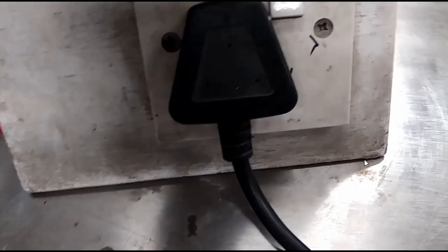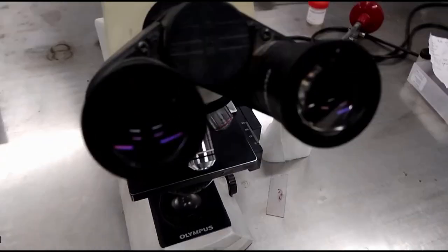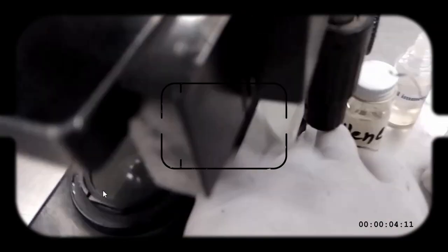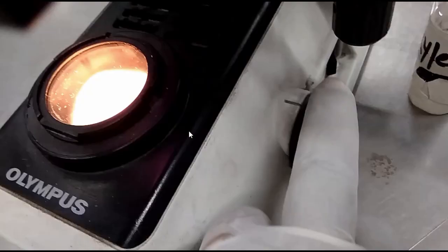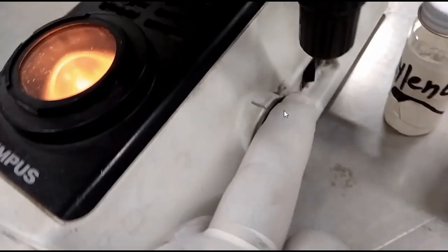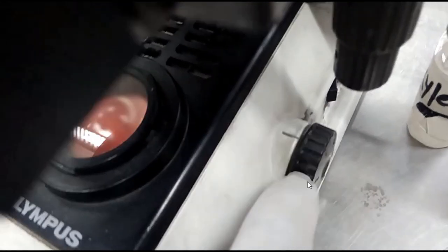Know the working mechanism. First, switch on from the main source. Now switch on the microscope switch. In this way we can adjust the light intensity. This knob is for light adjustment.